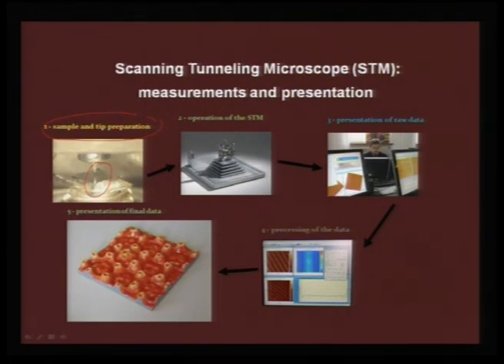With the optical microscope, you can bring it as close as you can, and then you allow an auto approach for the tunneling to be established. So today's experiments allow the tip to do an auto approach. You bring it as close as you can by following it through a microscope, and then you allow the machine to do the auto approach so that the tunneling will be established. Once the tunneling is established, you are ready to go for mapping the surface.